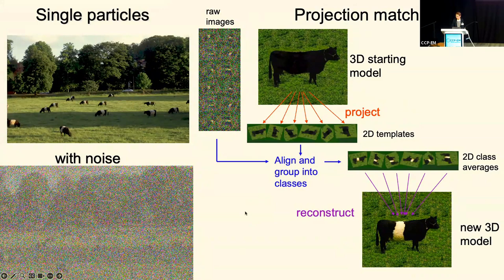So that was pretty good. And I like to use this to explain why there was a quite strict lower limit to size, because if there was a mouse in the field, you wouldn't be able to find it in this noisy image. So you had to have big enough stuff to do this on. One of the early things, the best samples at that time, were icosahedral viruses, because they were big and had lots of symmetry, 60-fold symmetry. And so those were very favorable objects.